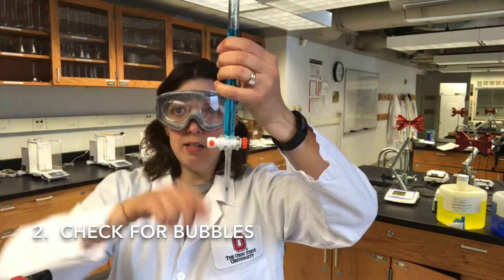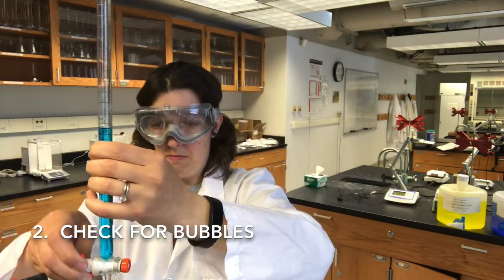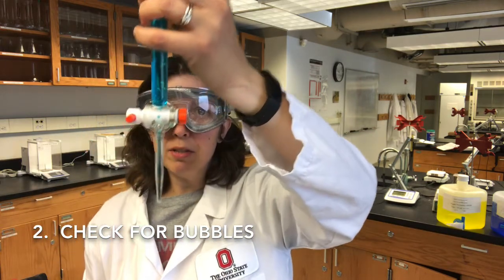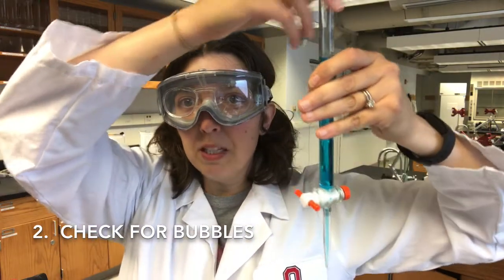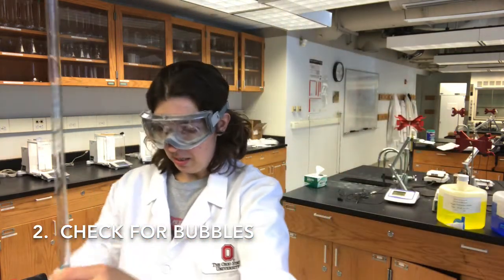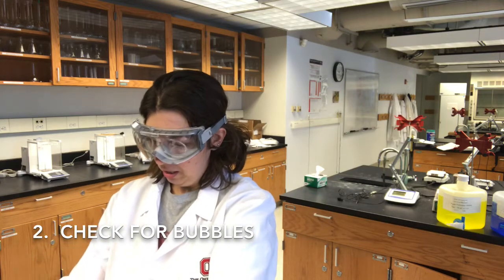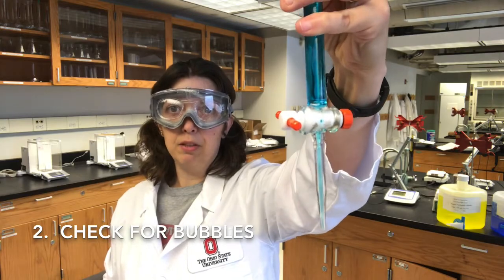First thing you can do is open the stopcock all the way — that might get the bubbles out. If you look closely, put it up against my coat there, you can see that there is still a bubble in that tip. So another way to get that bubble out is to open the stopcock, give it a shake, and now you can see that that bubble is gone.